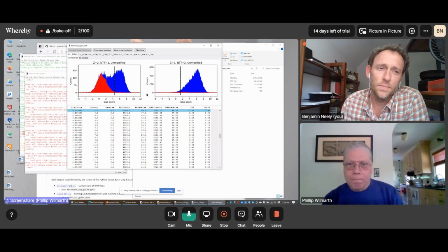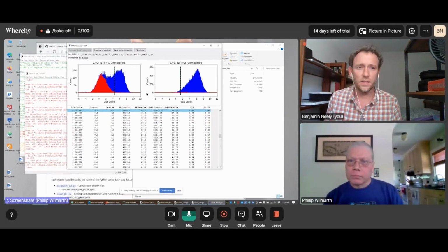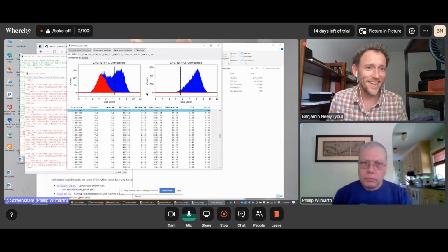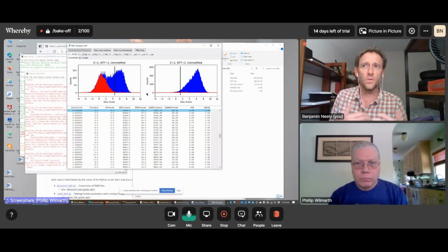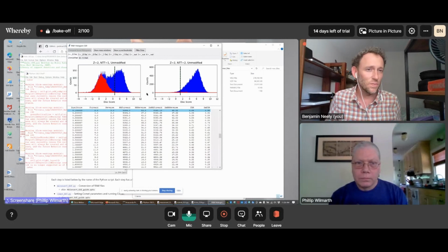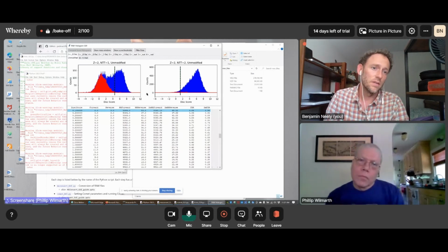Yeah, a quick question. First off, something I've really enjoyed in talking to people like you is that there's this kind of common knowledge that for certain biofluids, or all biofluids, semi-tryptic is appropriate. But if you didn't know that semi-tryptic was going on, is that something the data can kind of tell you? I always set it based on some experimental knowledge, making that choice.